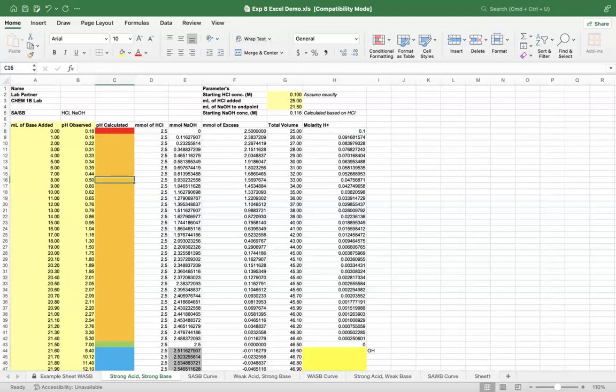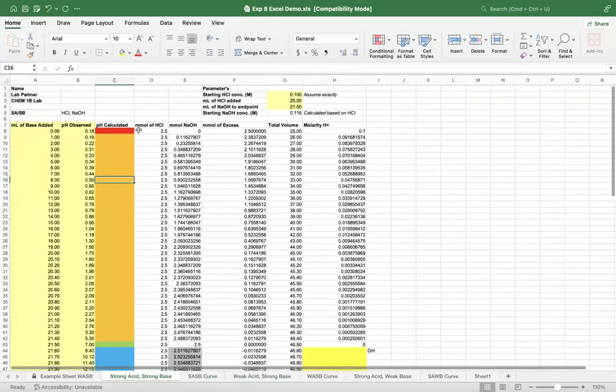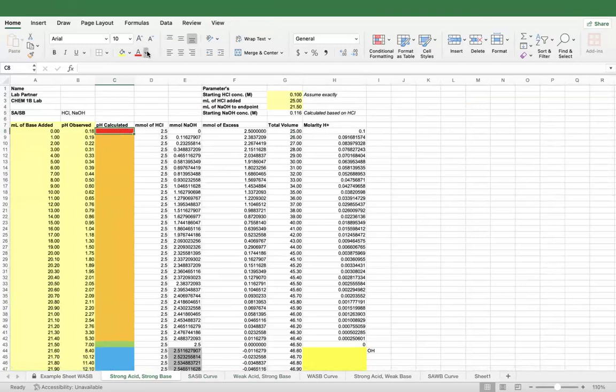In fact, sorry, I don't think I need a red one actually, because I think this isn't a buffer system. So yeah, my bad. I don't actually need this. It doesn't matter. Let's see. Copy, paste.